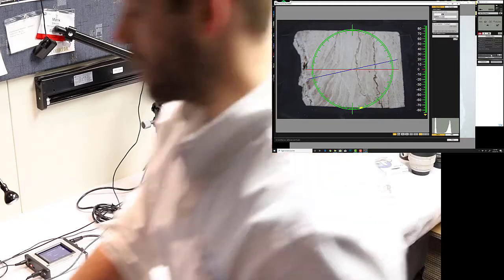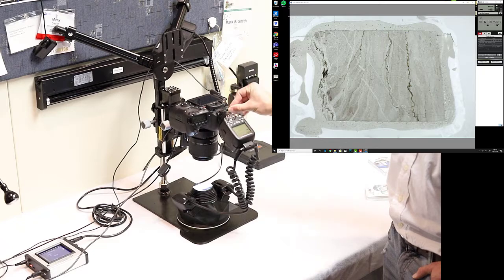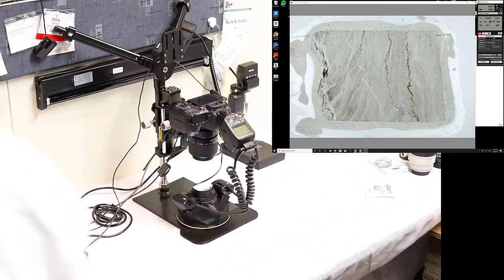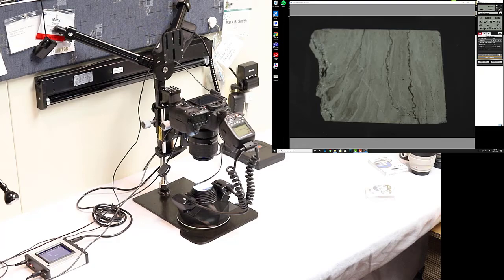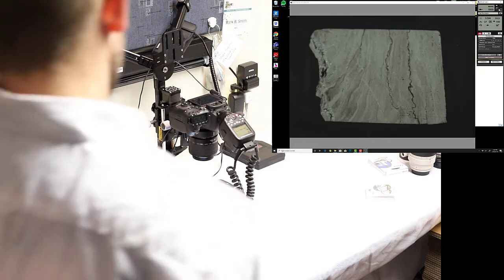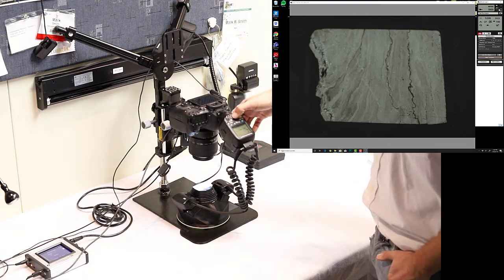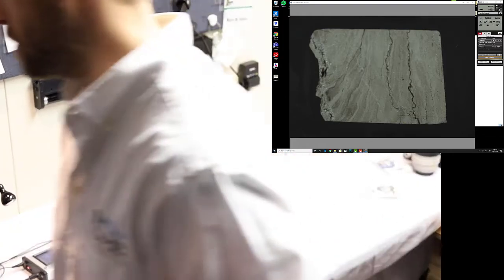Now what we're going to do is come back. We're going to set our camera back up into manual mode, and it's possible that we might need a little bit brighter light in order to resolve this, but then again our settings might be okay. So again, we're going to take a test image. So it's a little bit darker. One of the things I think we should do is give us twice the amount of light we have currently. So instead of 1/512, we'll go to 1/256.